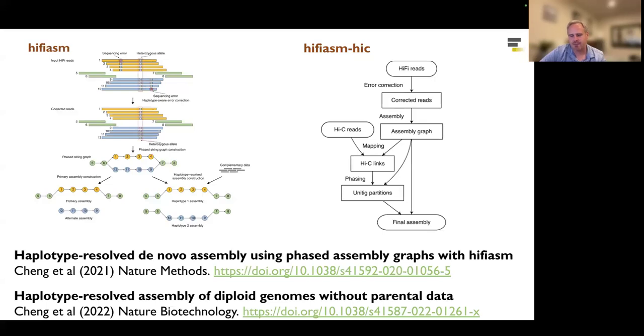You can sometimes look for markers of genes where you know that they are present only on one chromosome, especially on the sex chromosomes, where special genes should be present only on the maternal or paternal chromosomes. If you know there is imprinting of genes, and you have RNA-seq data, you can sometimes use that to resolve what's maternal and paternal. There may also be other epigenetic information you can use.